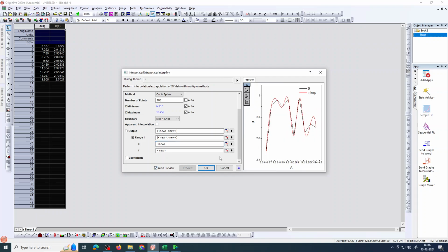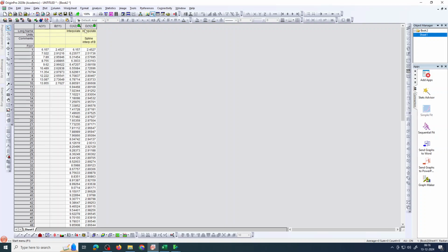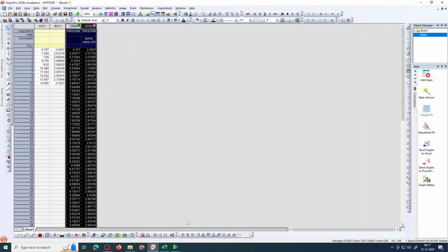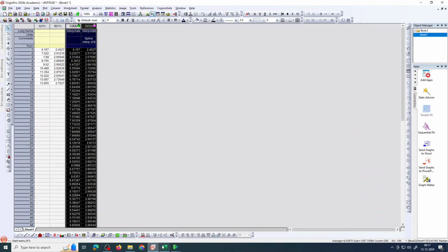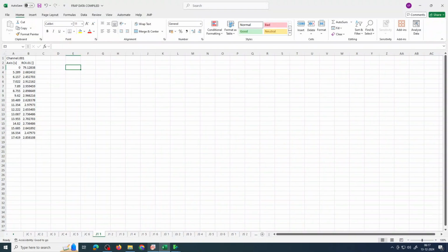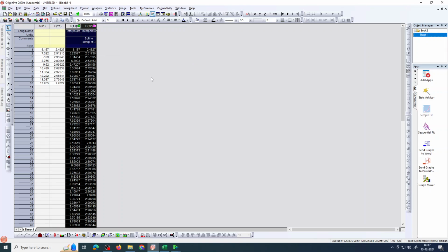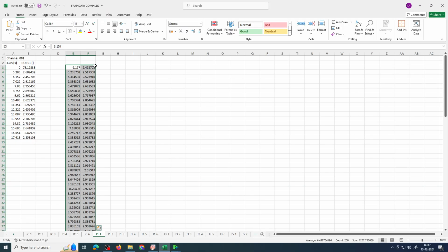So deviations are not so high, and thus this is interpolated data. So this data we will simply copy and paste, and then the procedure remains the same. If we go for this particular thing, we have to go, okay. So this should be escaped, and then we have to copy it again, like right click, left position, and then we will simply paste it. So this is your data, and as usual, as I've already shown you, you have to plot the data.